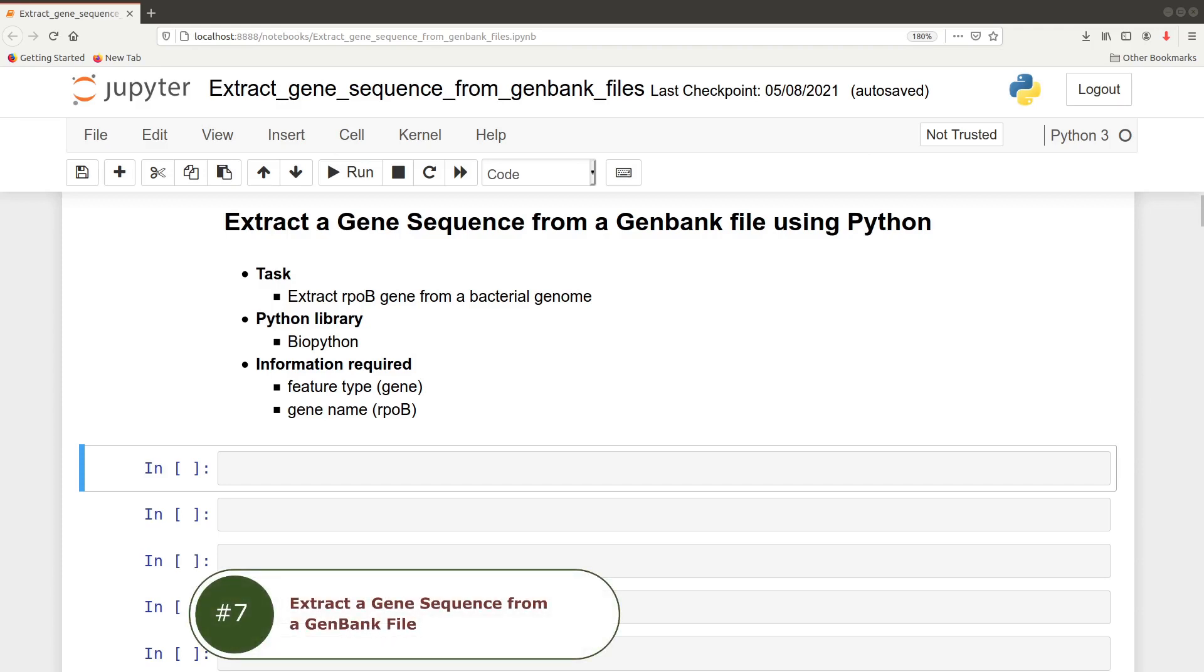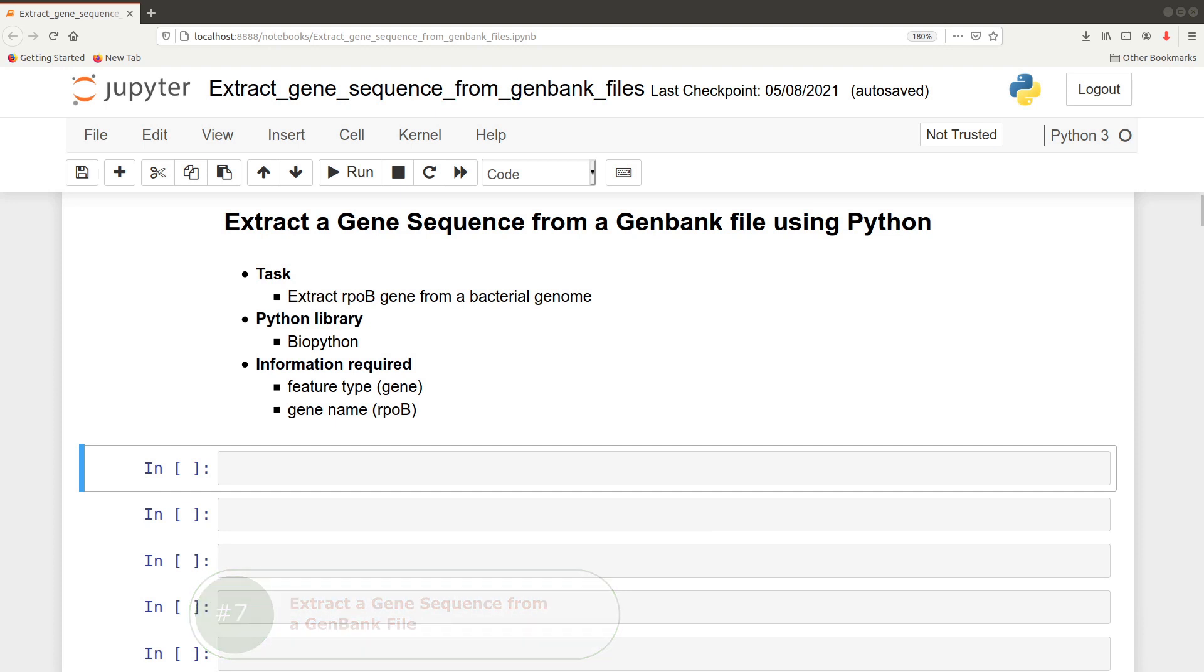In this tutorial, I'm going to show you how you can extract a gene sequence from a GenBank file using Python. For this particular task, we're going to extract the rpob gene from a bacterial genome using the Biopython library.